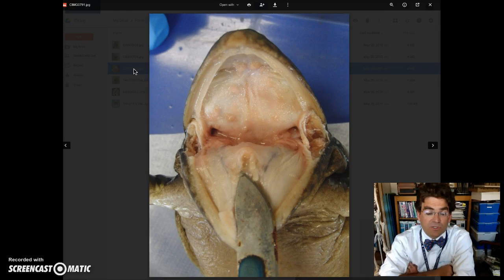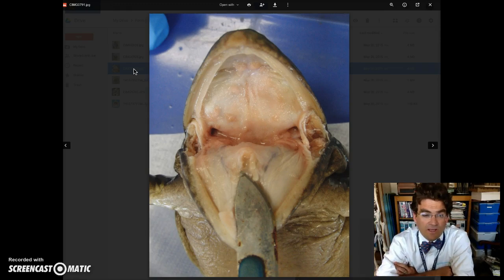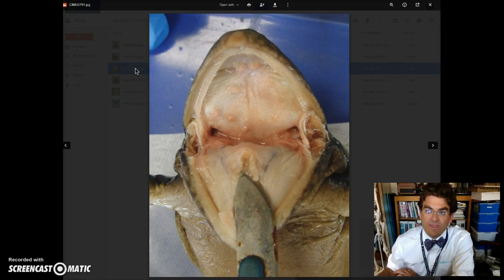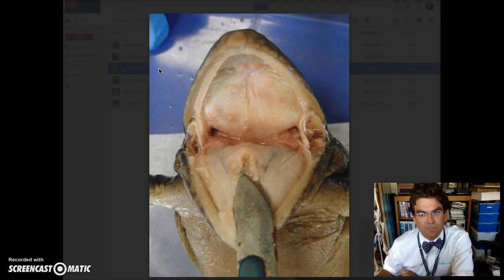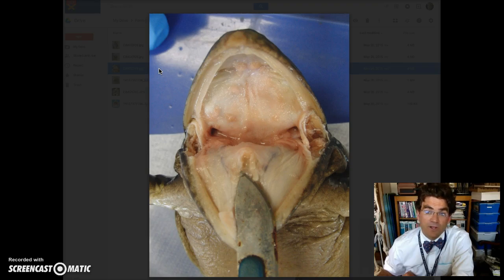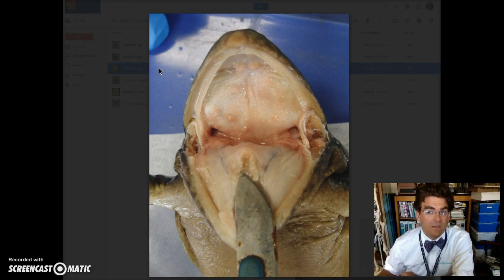This is a picture of the inside of the frog's mouth, and the things that you need to identify in this picture, as stated in the lab, you're going to need to label the tongue, the esophagus, the glottis, the eustachian tube, the vomerine teeth, and the maxillary teeth.